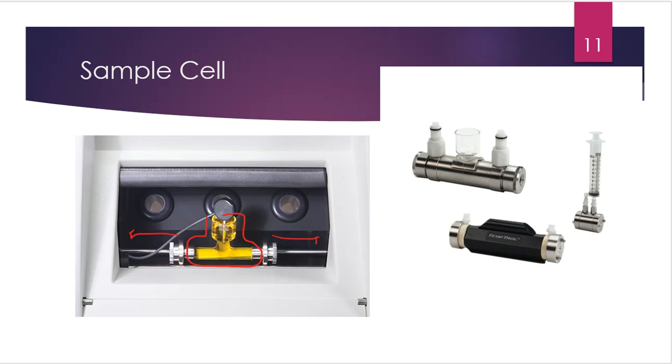And that's what you're seeing here on top, this kind of black knobby thing that has a stainless steel probe that goes inside the solution. This has a cord that gets connected to the left-hand side, and that is a temperature or thermometer probe. That way, on the report or on the display screen, it's telling you what the temperature actually is of the sample when it made its measurement.